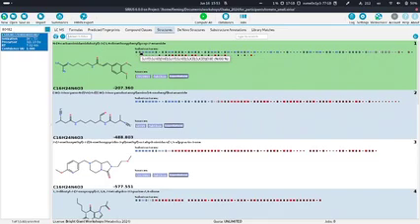What is maybe very important to mention here, especially now that we are going over some specific structures, is that we are not anymore in the de novo part. So we are now looking for hits in structure databases. But what is very important is that the structures we have here don't necessarily correspond to the compound classes we have predicted. The compound class prediction is still de novo. So it's often a good idea, if we now look at specific structure hits, to see if the compound classes also fit the compound classes that we have predicted.